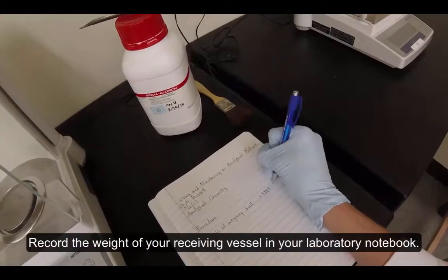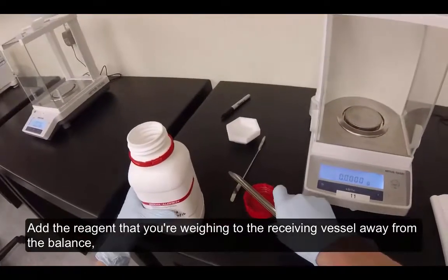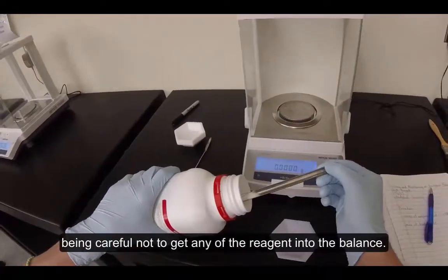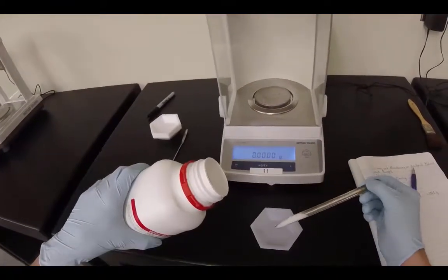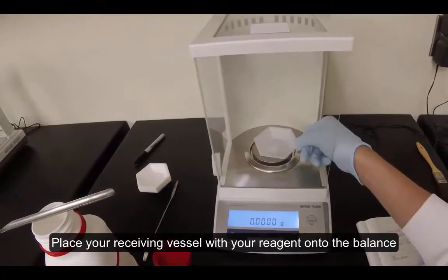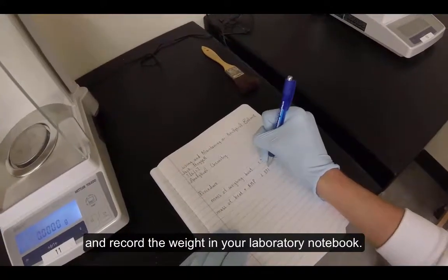Record the weight of your receiving vessel in your laboratory notebook. Add the reagent that you're weighing to your receiving vessel away from the balance, being careful not to get any of the reagent into the balance. Place your receiving vessel with your reagent onto the balance and record the weight in your laboratory notebook.